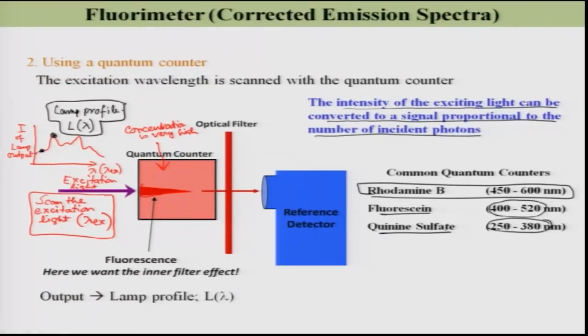Okay, so, hopefully you understand how to correct the emission spectra. Whenever you report, if you ever use fluorescence spectroscopy in your life, please remember that we should report the corrected emission spectra, not just the simple emission spectra.